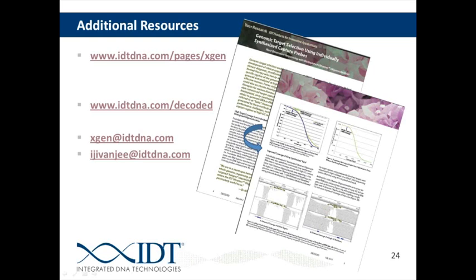Essentially those baits, as they're called, are synthesized in parallel in femtomolar quantities, then cleaved off the array, put into a tube and shipped to the customer. So it's virtually impossible to QC the presence of any individual probe sequence.